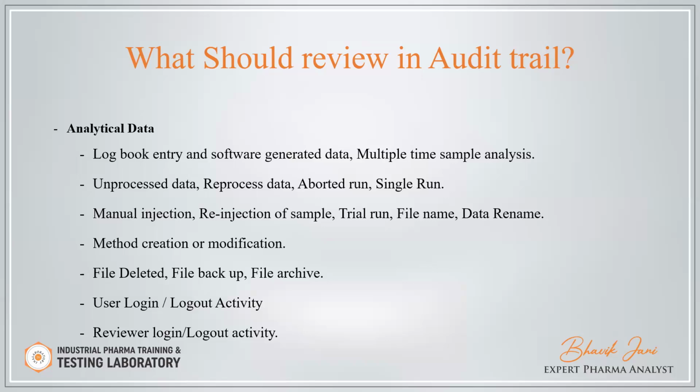Then method creation or method modification, data deletion, file backup or file archive, user login or logout activity, reviewer login, reviewer logout activity. All the activities should be reviewed during your analytical raw data review, and all these points should be reviewed before releasing the batch.